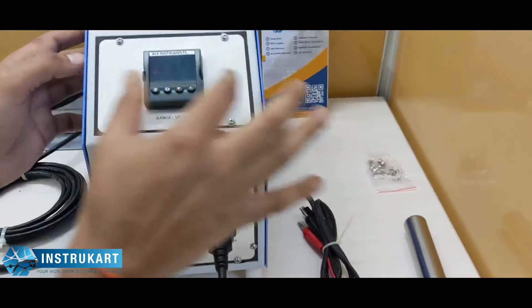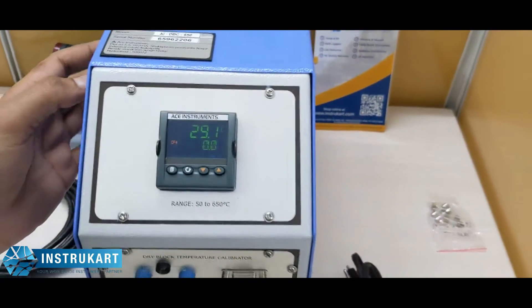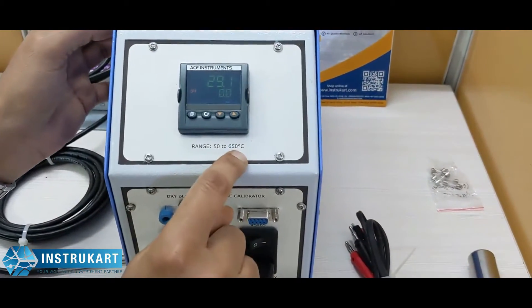You can have two displays side by side with a different model where you can check that. This dry block calibrator family range is 50 to 650 degrees.